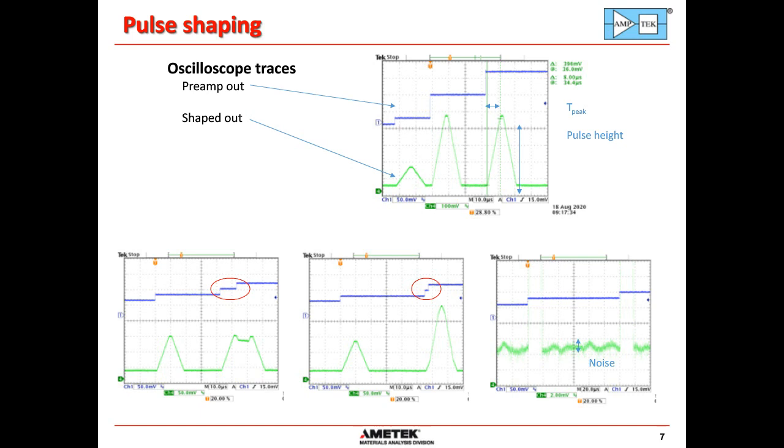It's commandable to different values. Generally, it needs to be longer for the silicon PINs and shorter for the SDD, and shorter yet for the fast SDD. Again, in the next seminar I'll discuss a little more exactly how to set that. If you set it to 0, then you lose no time, but you get a distorted spectrum out. So there's some trade-off between setting that to its longest and shortest.